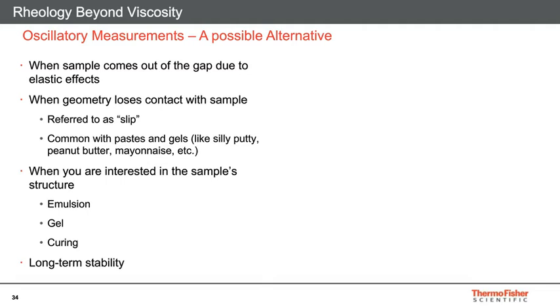So typically, one metric that we measure most commonly with rheology is viscosity. And we do make viscosity measurements in a rotational fashion, right? We're rotating that top plate or cone or the inner cylinder in a unidirectional way. We're just rotating at different speeds and measuring the viscosity.